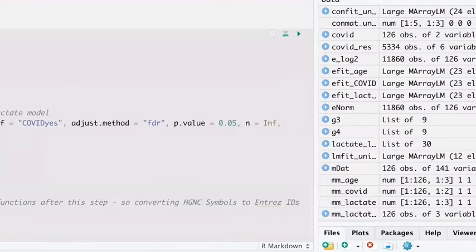So there's quite a few comments that I've made in the actual script, but I'm only going to be typing in the functions that we'll use. So we're going to use this package called biomaRt, and the mart object is the one that specifies which dataset, or which organism, within this biomaRt package to use. So we're using the Homo sapiens database because our samples are human samples.